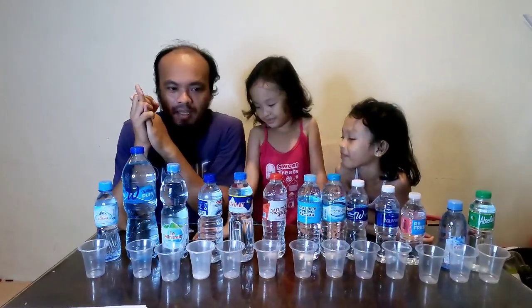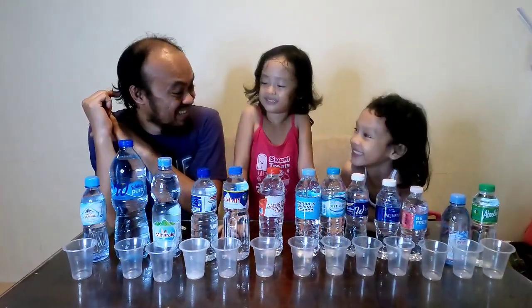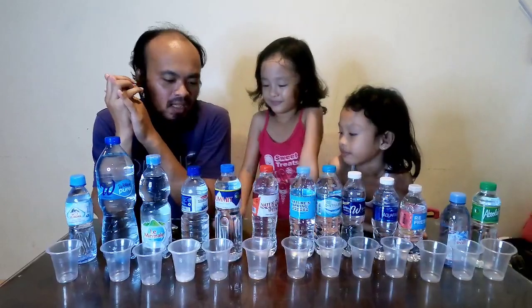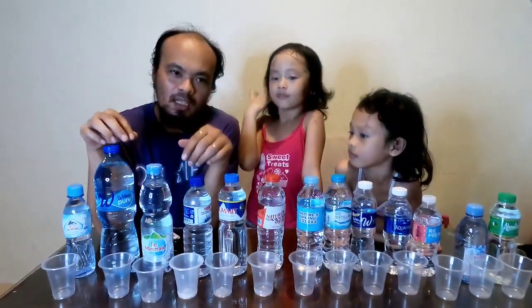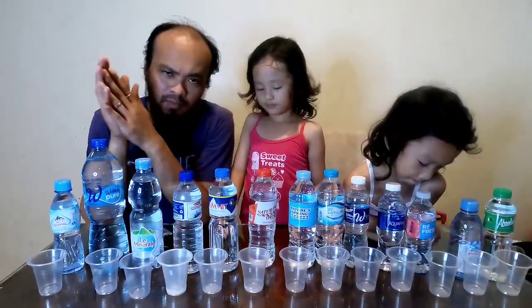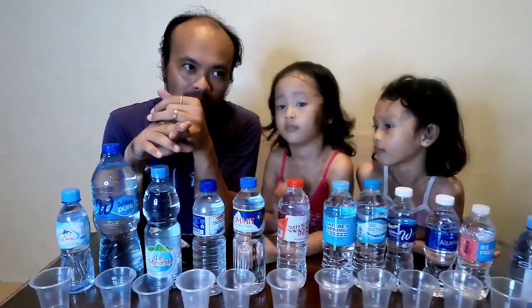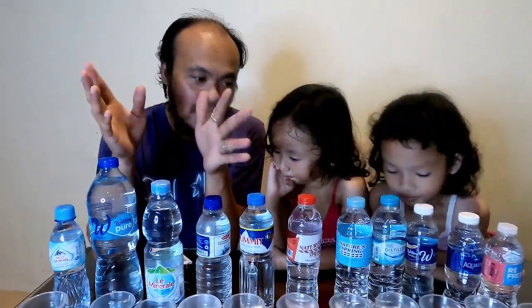For today's video we're gonna do a water testing. Water is good for the body, so what we are trying to do here is to check the pH level of different brands of water — if it's acidic, neutral, or alkaline.